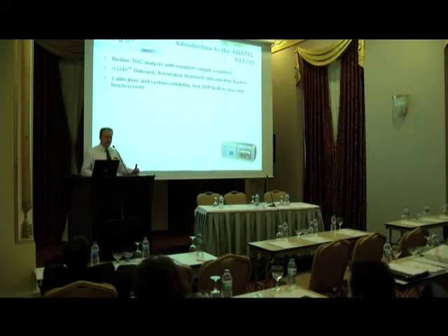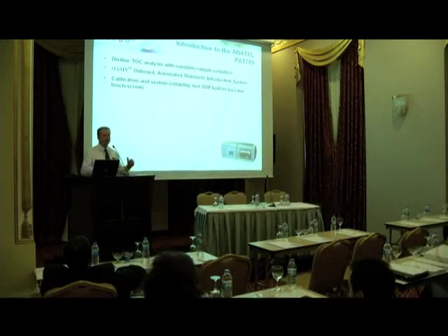So unlike the TOC analyzer in the quality control laboratory, where we have QC technicians on hand who are very, very knowledgeable about system suitability, calibration, once one of these analyzers moves into the production area, typically the people carrying out these tests will be technicians and engineers. So having the built-in SOPs will help them walk through the process. They don't need the in-depth knowledge that a QC technician might have.